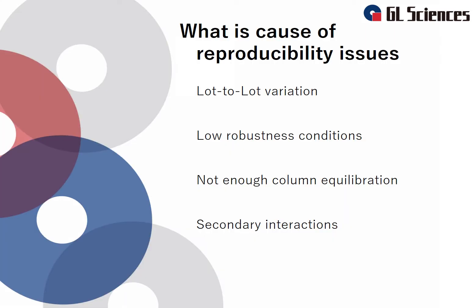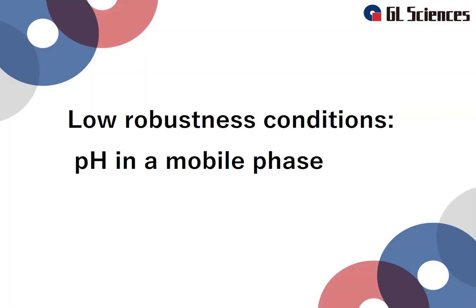There are multiple causes and they can be difficult to identify. There are four relatively common causes concerning inquiries we receive: lot-to-lot variation, low robustness conditions such as mobile phase pH, not enough time taken for column equilibration, and secondary interactions such as silanol interactions. This presentation will focus on the impact of mobile phase pH on the robustness of a method.